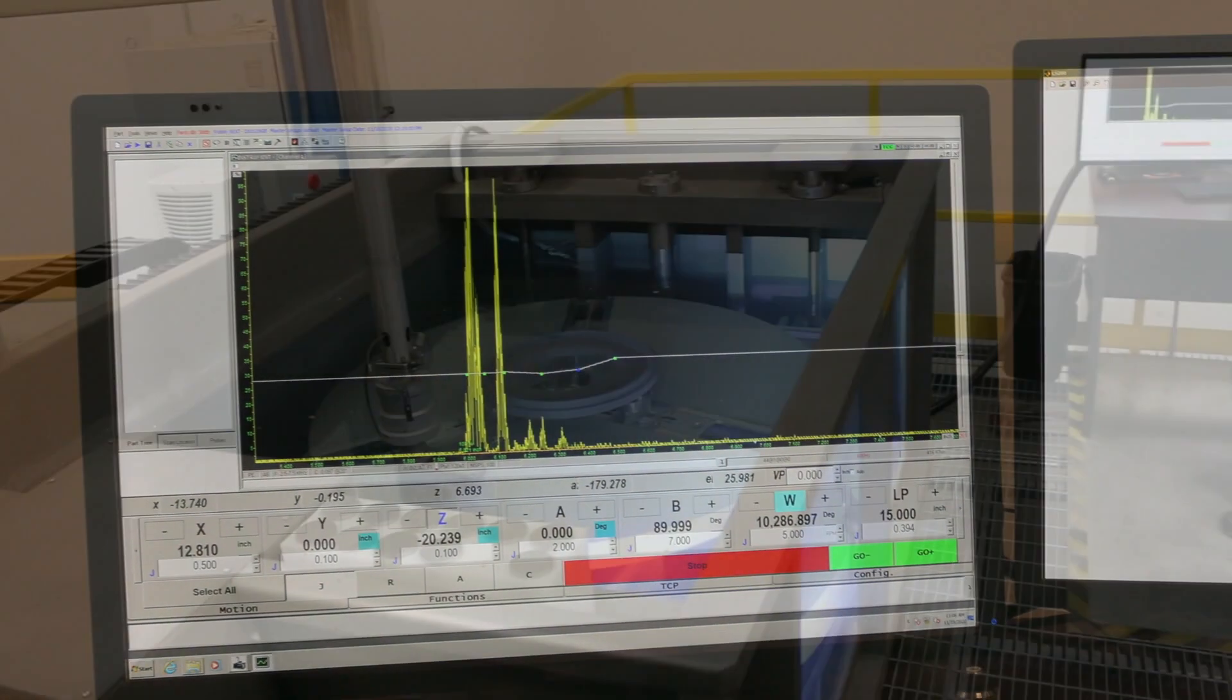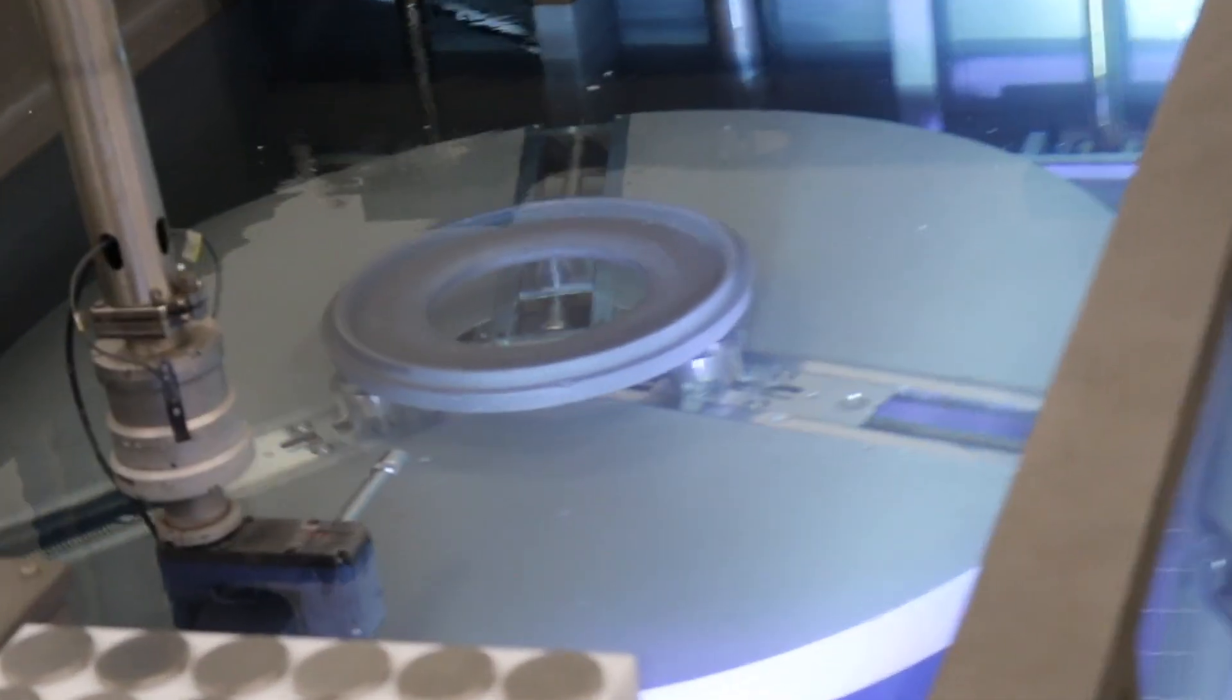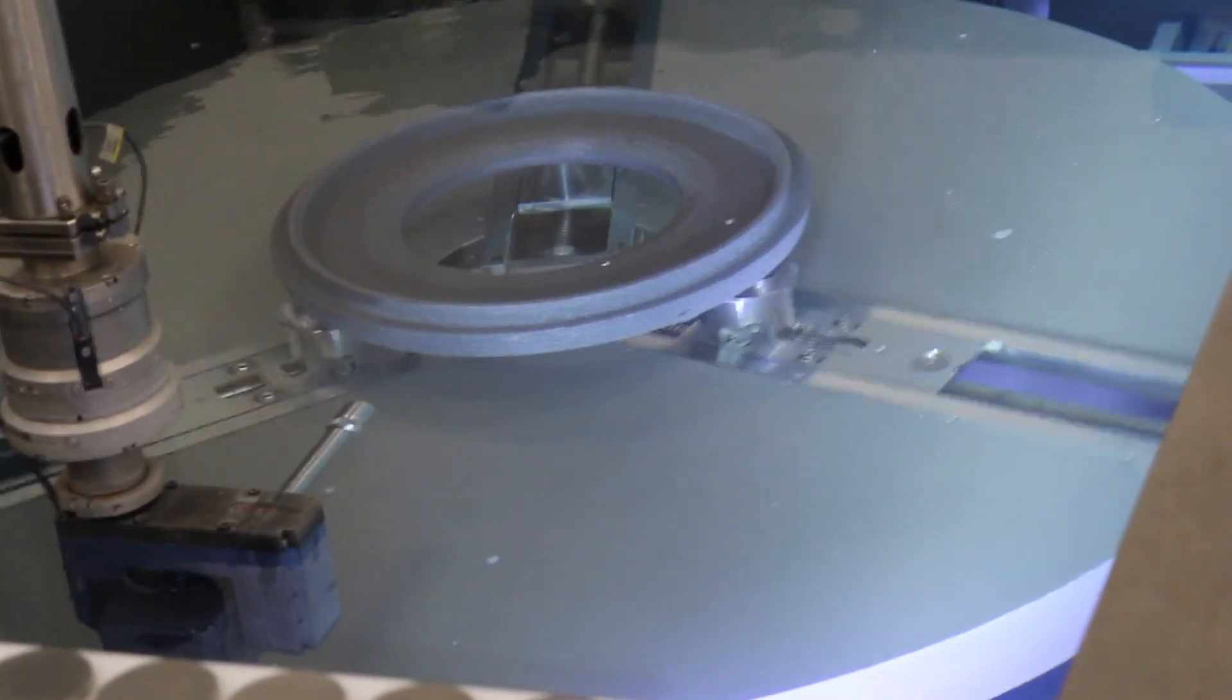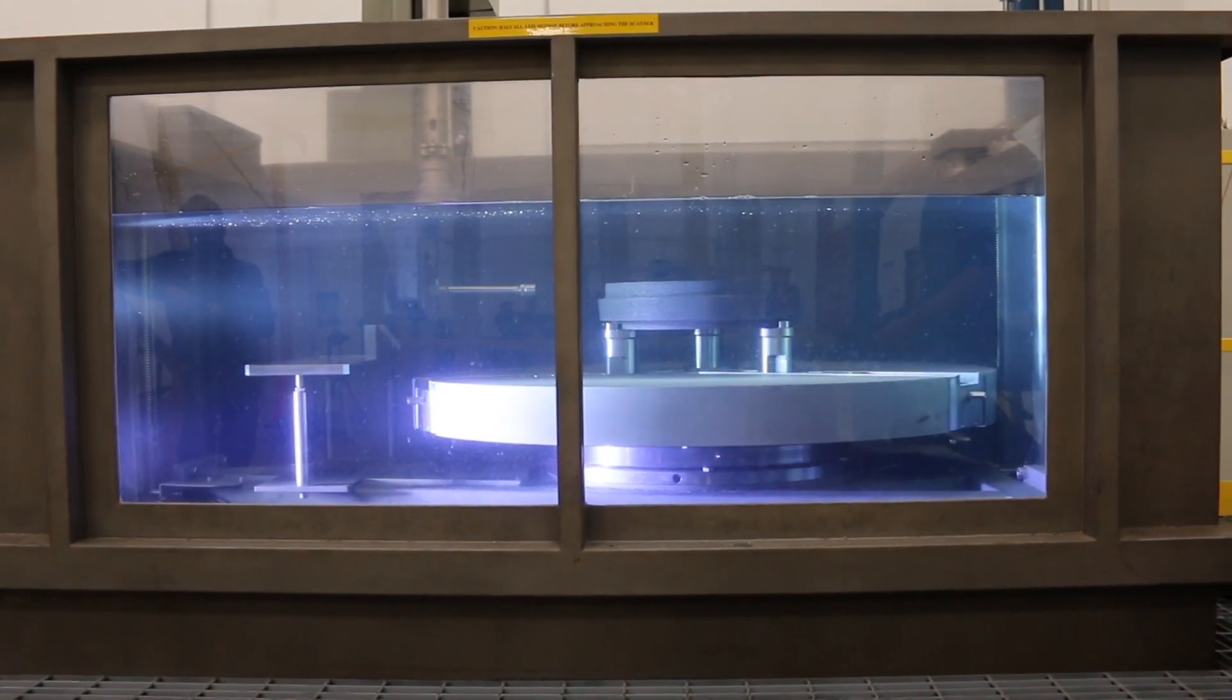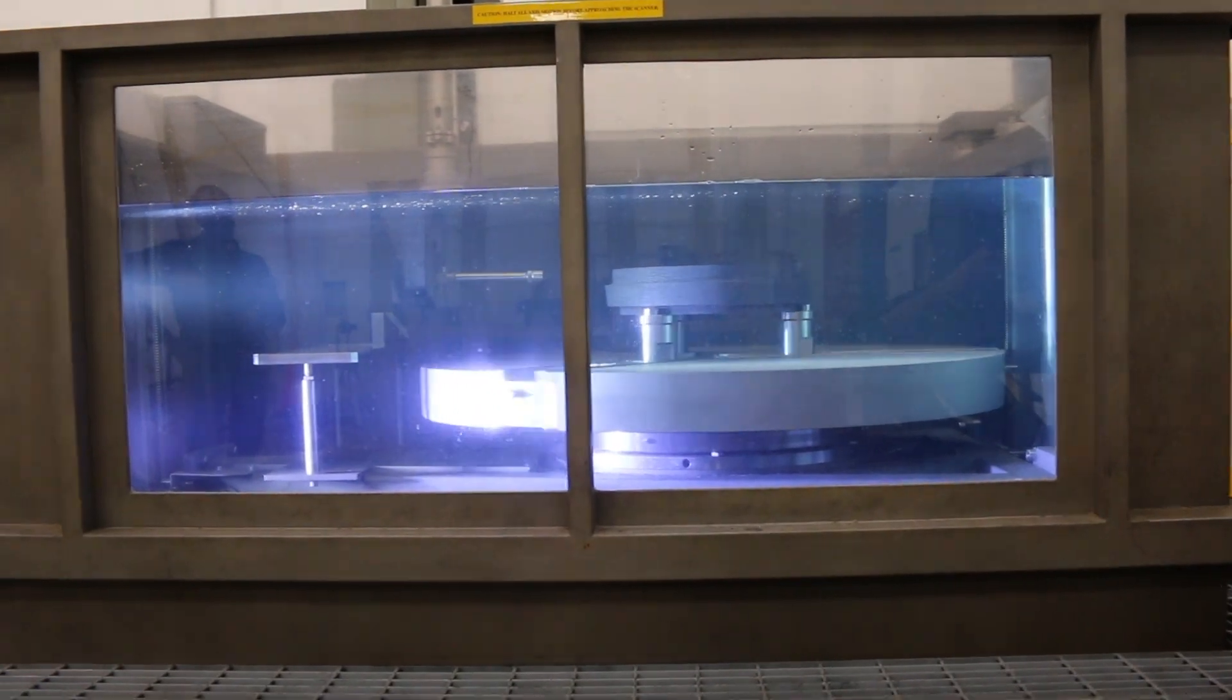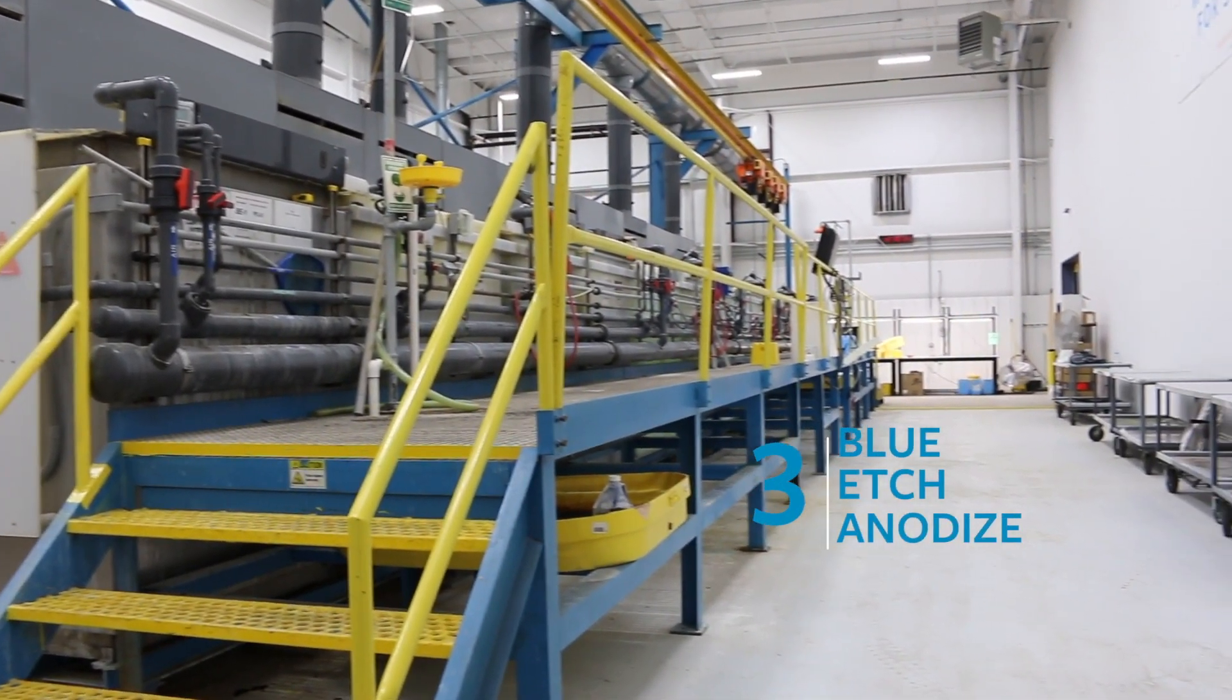Our inspection systems allow us to manipulate sound to assure the completed internal inspection of a component. UT is commonly used to detect subsurface laps, cracks, inclusions, bursts, etc. It can also be used to detect grain size or grain size variations which may be detrimental to the part in service. Our third inspection technology is Blue Etch Anodize.